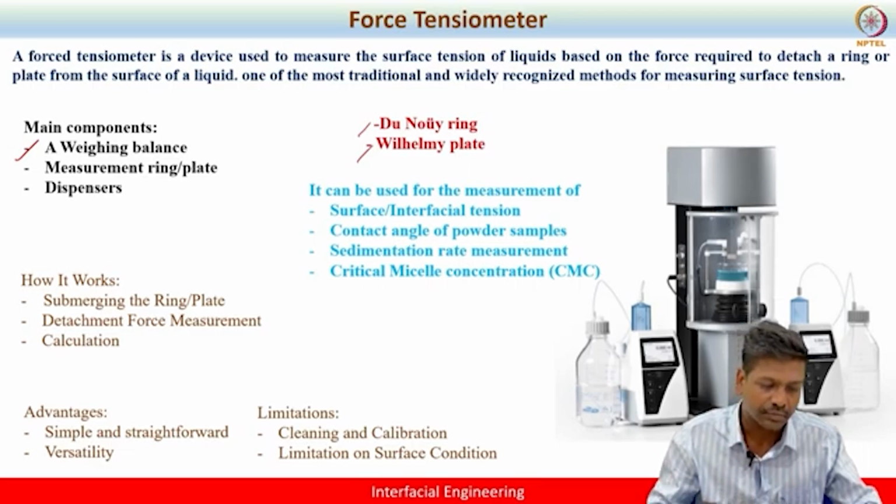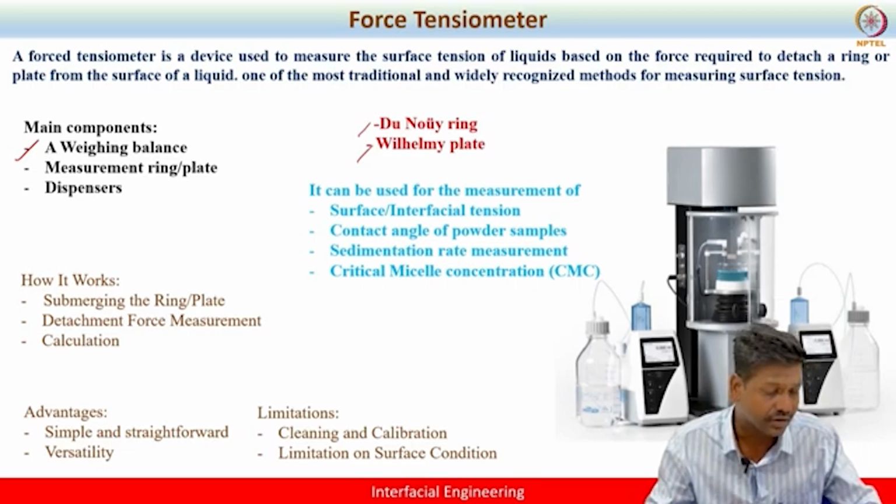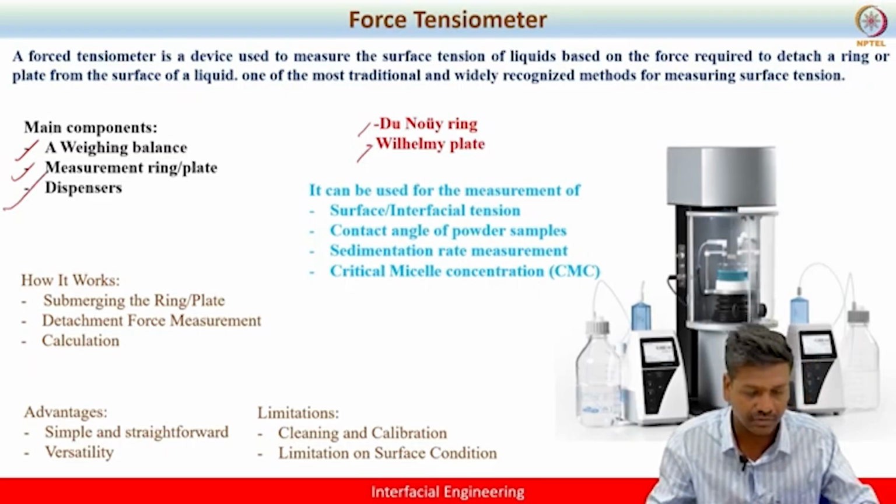It consists of three important key components: the weighing balance, the measurement ring or plate, and the dispenser, right?